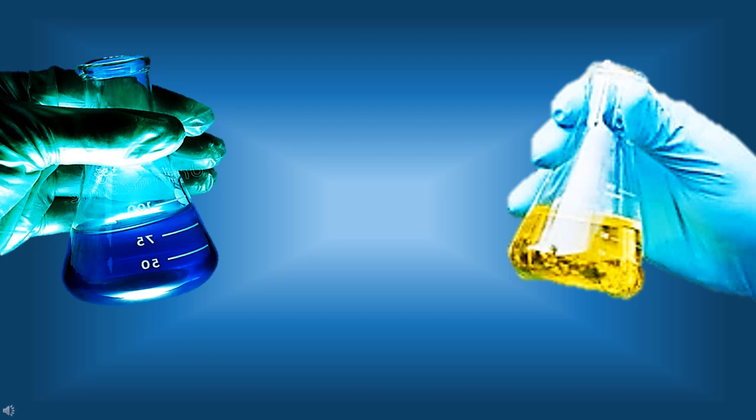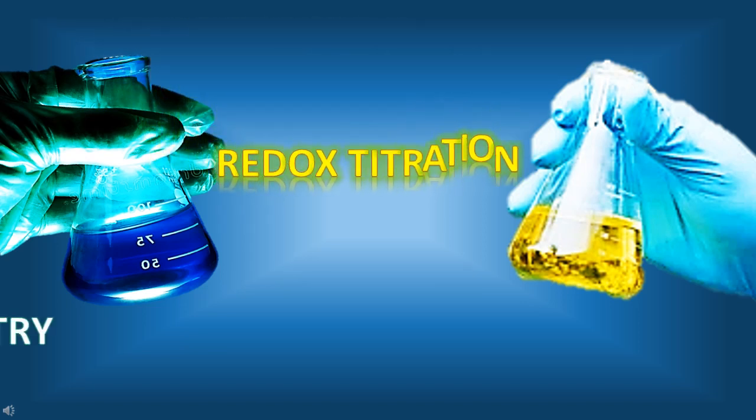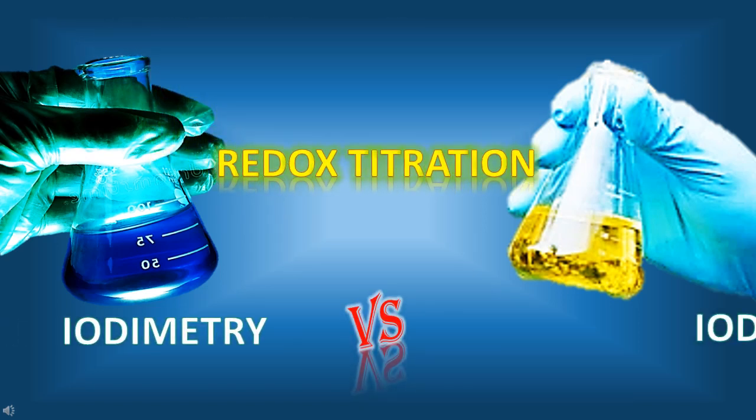Welcome to Tegomatics. In this video, we'll be learning two kinds of redox titration. The first is Iodimetry and the second Iodometry.